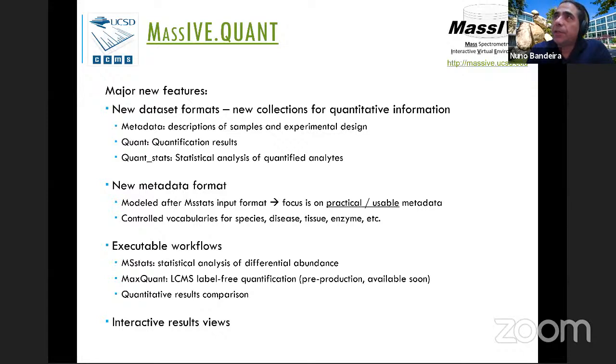Are there limitations? I'm sure there are. I don't want to say that there are low limitations and anything is possible, but I can tell you that in terms of volume, our human libraries start with dozens of terabytes of data, and they start from hundreds of millions of PSMs. So the system is able to scale to those levels.